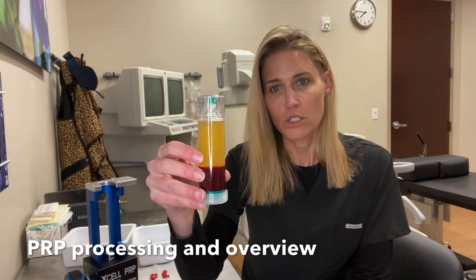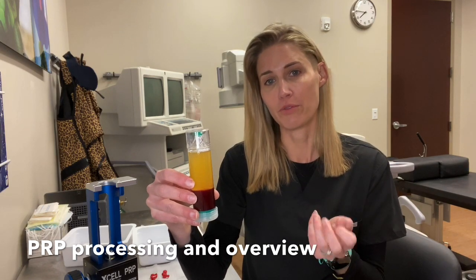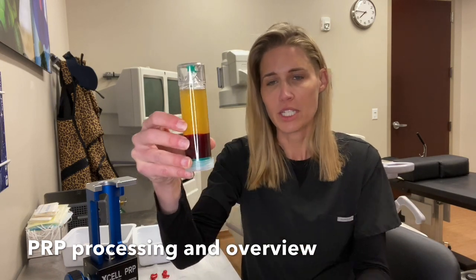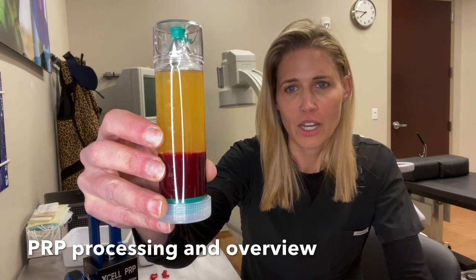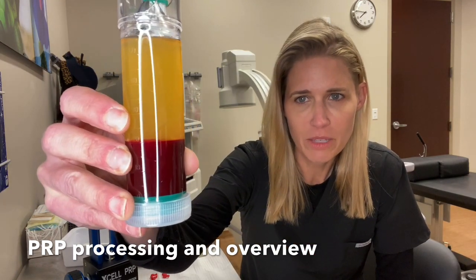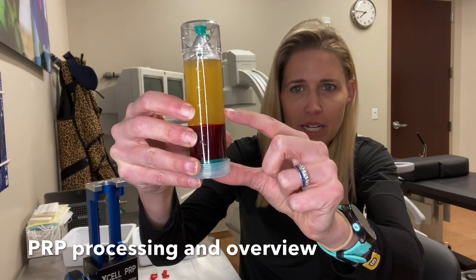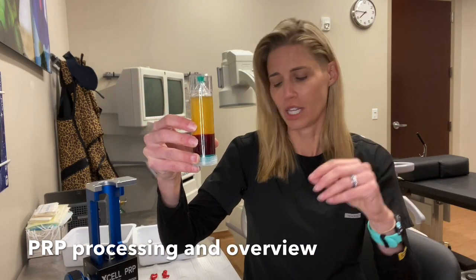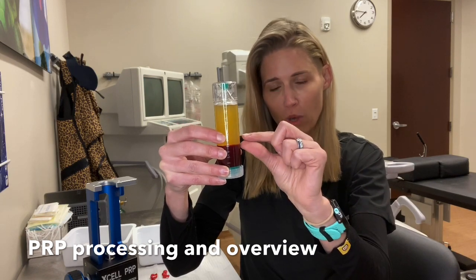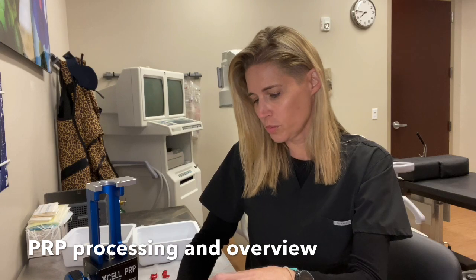So first of all, this is blood that I spun down in a centrifuge. I used a centrifuge that spun it for 10 minutes in a single spin — there are several machines where you have to do double spins. What you can see here, if you look at it closely, is you've got the red blood cells on the bottom, the serum on the top, and right in the middle is what's called the buffy coat — the white blood cells. And in that same area is where the platelets are concentrating. That's what we're really aiming at.